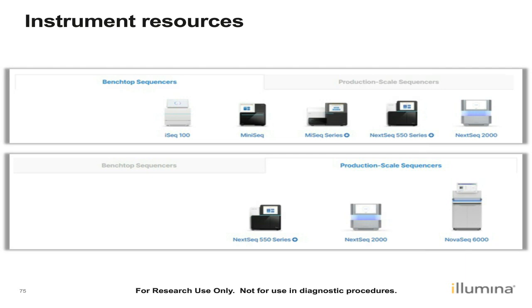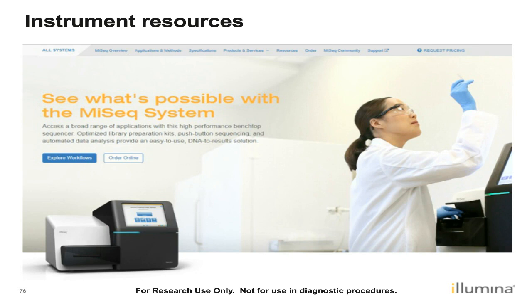Once selecting the sequencer, it will bring you to the instrument landing page, which includes a lot of super helpful resources. Let's first select the specifications option at the top.